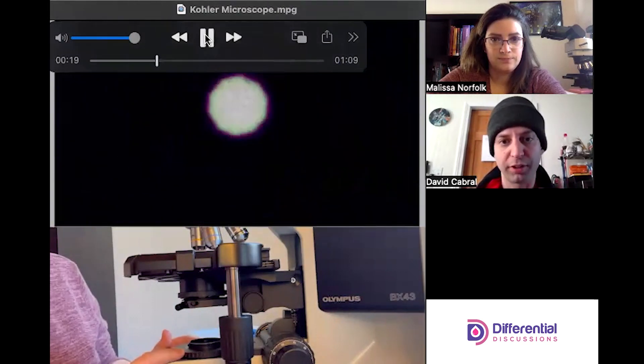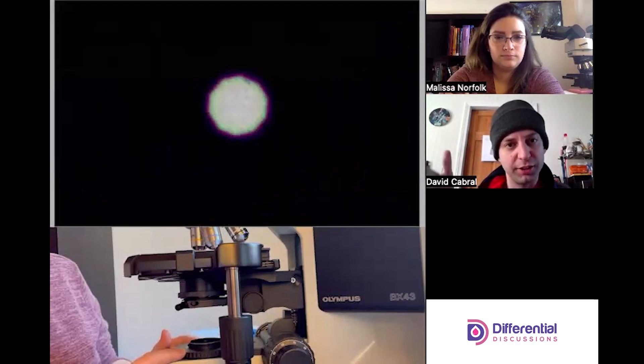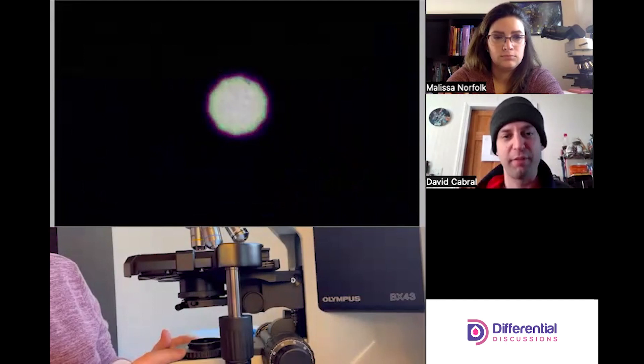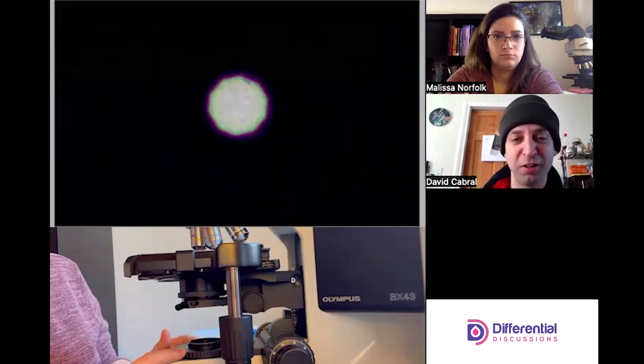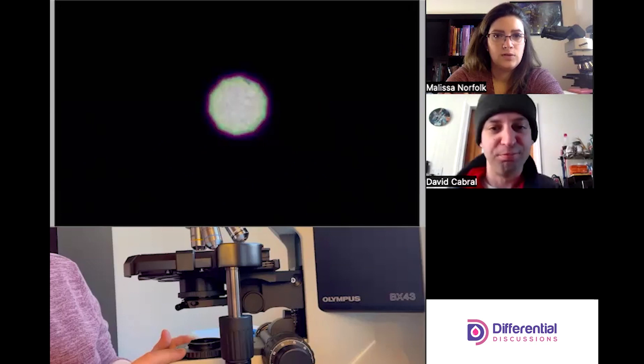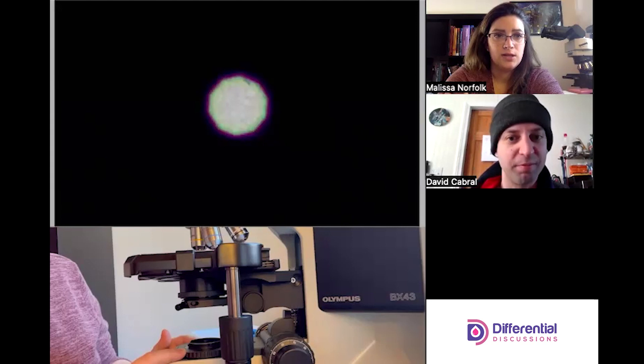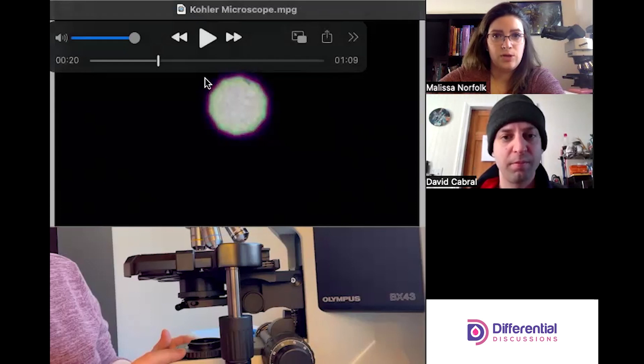As she turns this and lowers the diaphragm, you see the light kind of come in and then we see this kind of shape—there's a little bit of a geometric shape that appears outlining the image. This piece is really what's going to help us focus that light between the iris diaphragm and the condenser. We've just kind of closed the amount of light that we're allowing into the field, and so you can see this little geometric shape here because of how we closed it off using this piece.